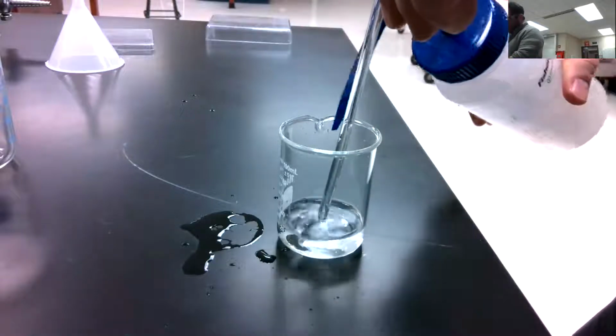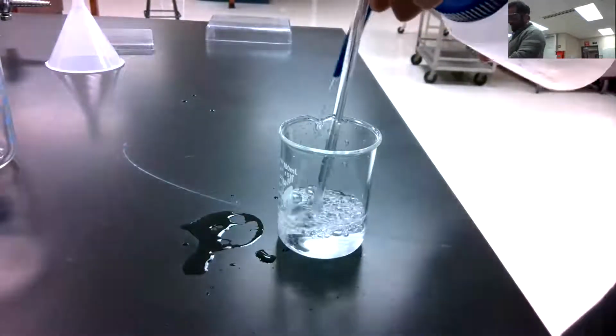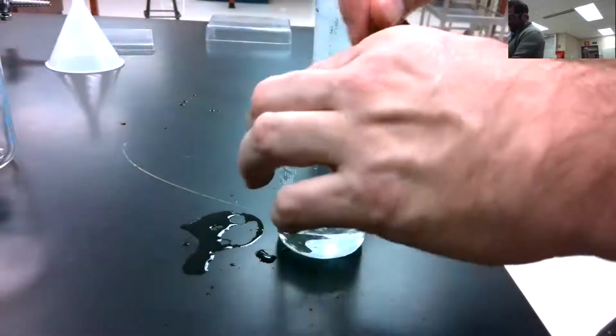Add a little more water. See if that helps. And the overall amount of water is not terribly important for this lab.